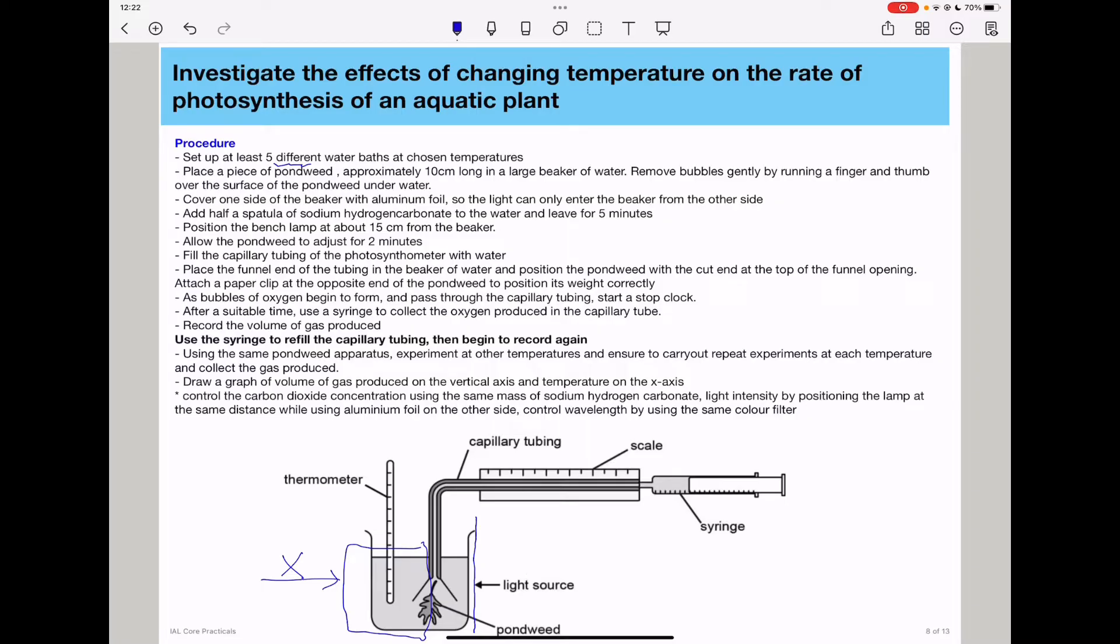The next part is to cover one side of the beaker with aluminum foil so that the light can only enter the beaker from the other side, meaning the place where we can control the amount of light entering the beaker, and that is this side.